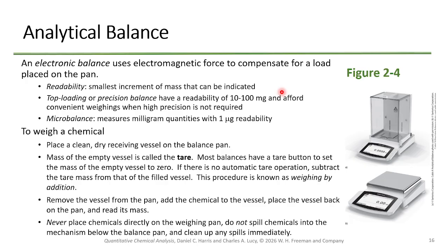Okay. The other thing that happens with analytical balances is that they have a percent, usually banded percentages. So if you weigh something that's a lot of mass, you're going to have a less precise measurement, at least an absolute measurement. Instead of being 1 microgram off, you might be a milligram off.